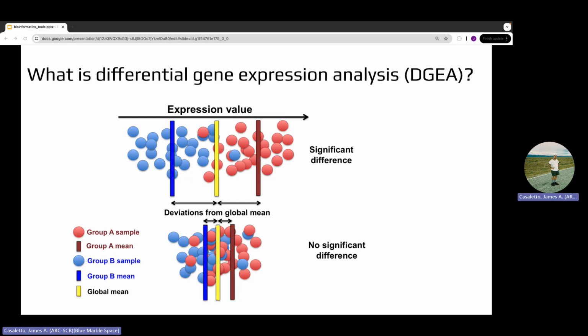In our case, the experimental change is whether the organism was flown in space, i.e. spaceflight, or not, i.e. ground control. In our case, we wish to know if some genes are over or underexpressed as compared to the baseline, and any such genes we will call differentially expressed. The biological explanation for differential expression is that an organism is trying to compensate for the experimental change in order to maintain homeostasis within the cells, organs, and systems.